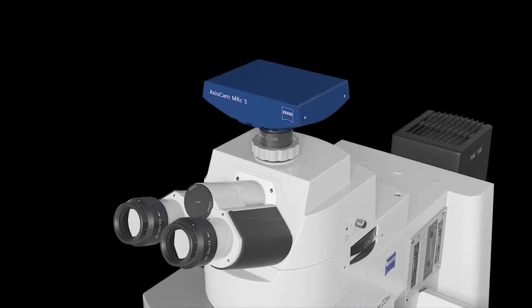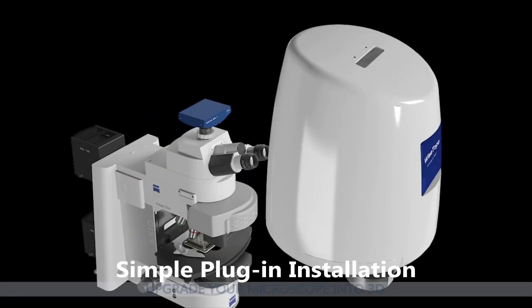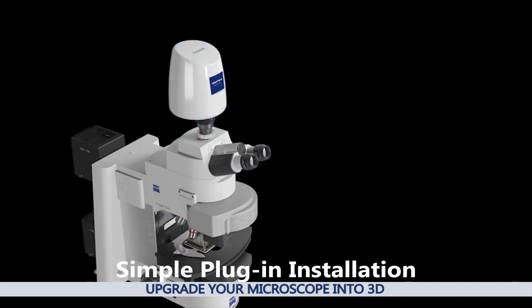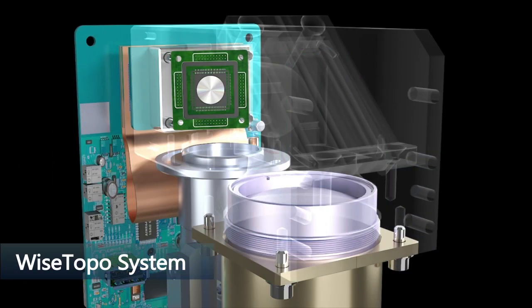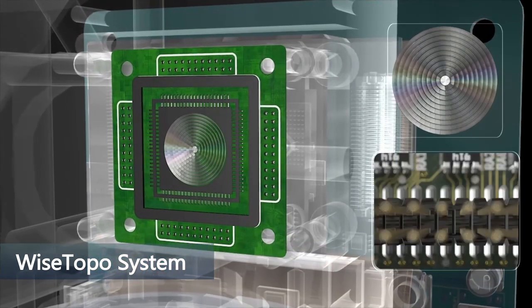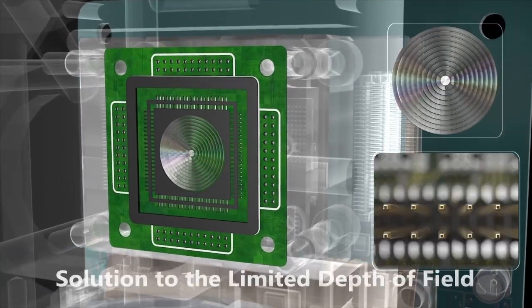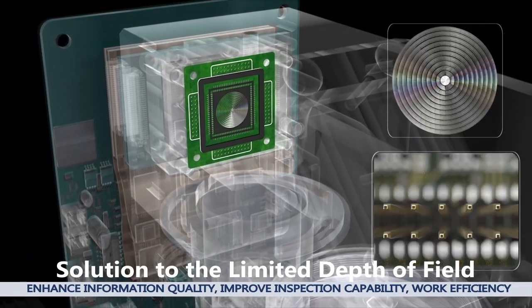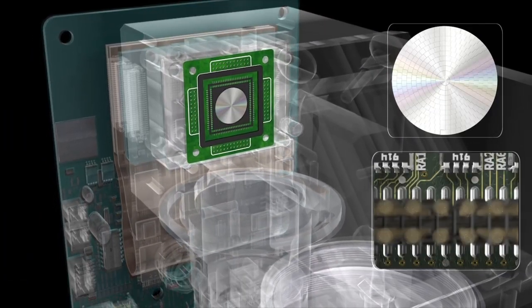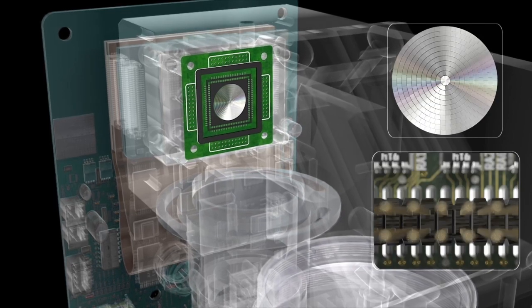SDOptics Wisetopo is the most innovative 3D microscope module, empowered with the patented Core Technology MALS. Wisetopo converts a 2D microscope into a 3D microscope by replacing the image sensor. With this simple installation, Wisetopo resolves the depth of field issue without z-axis movement.